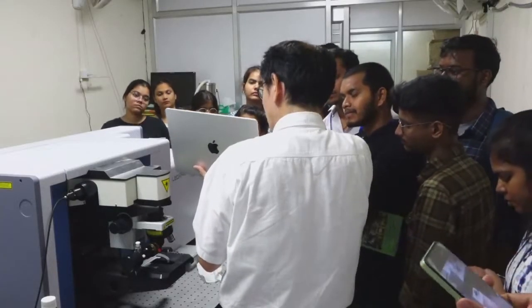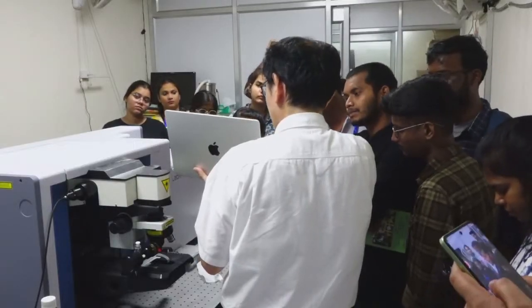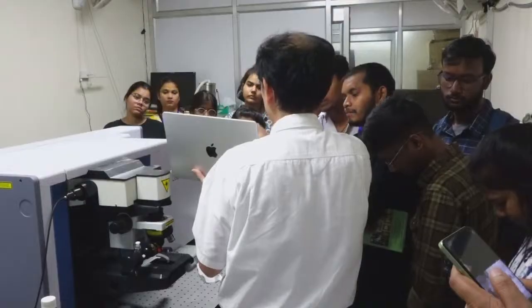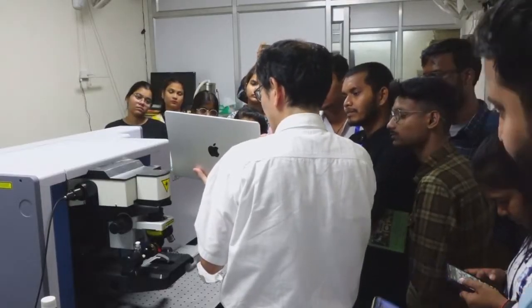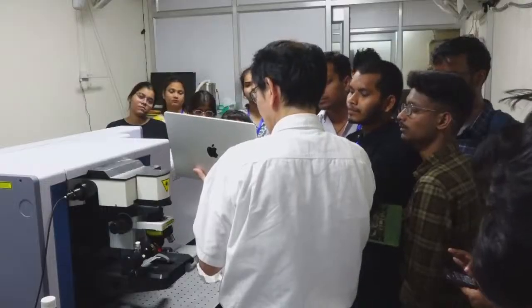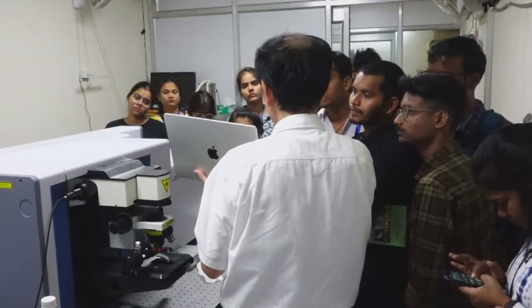But if the SN ratio is 1000 times better, then a one wave number shift will be clearly detected by calculating difference spectra. So the first priority is to get a good spectrum, then do the good data analysis. Then we can get much information from the spectrum.